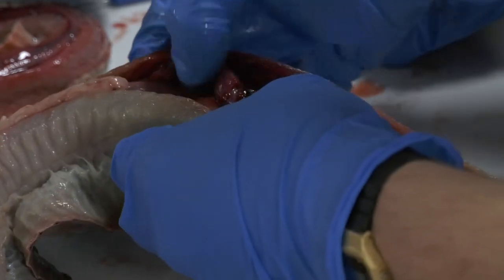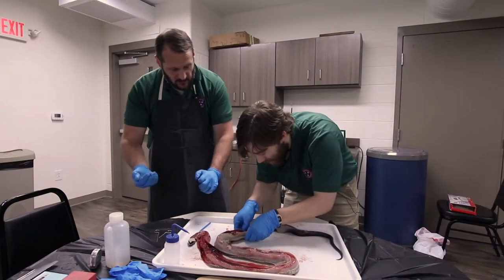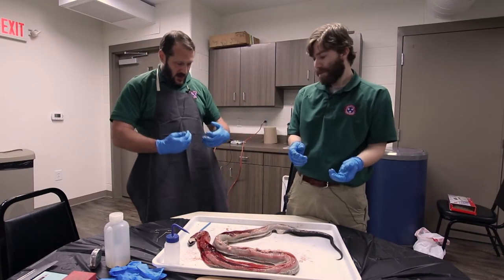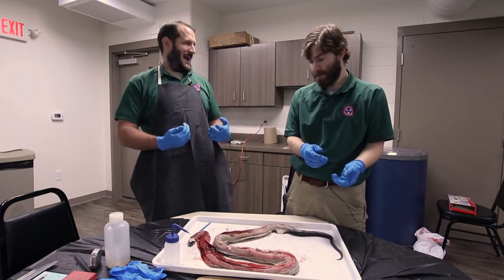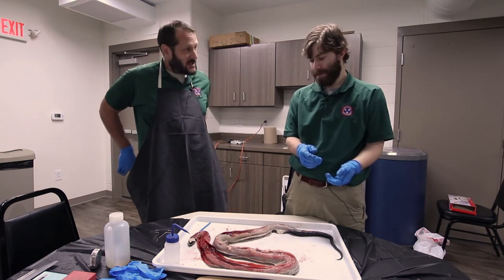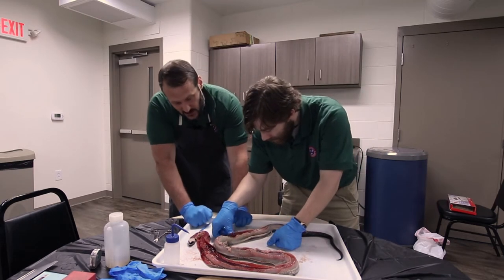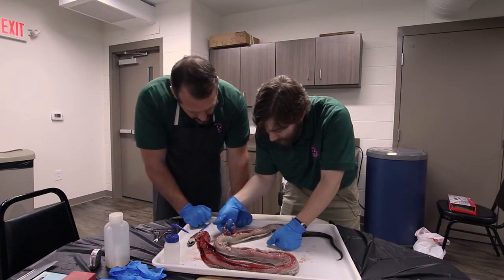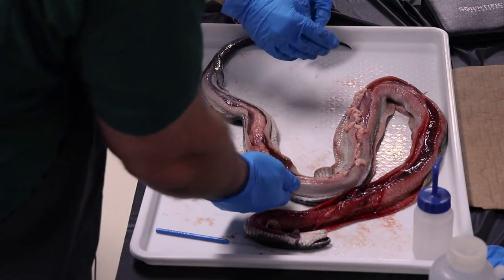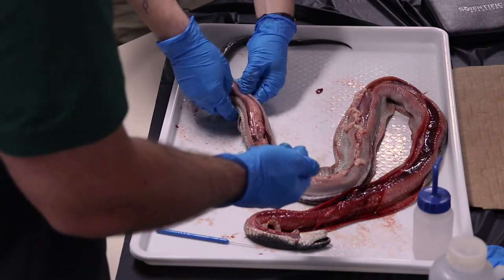I've done some reptiles before, but I've never dissected a snake. I know when you dissect a mammal, you find the kidneys are not in with the organ mass in the abdominal cavity. They sit far back, attached to the dorsal wall of the abdominal cavity. I don't know what to expect in a snake. This is all new for me. I think this is the gallbladder. And oftentimes when snakes are frozen, the gallbladder bursts open and you'll see a bunch of green staining. It's the bile.